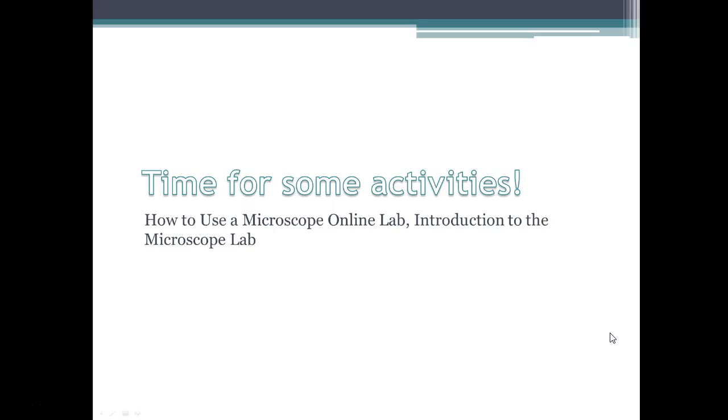So again, the best way for you to learn how to use the microscope is to actually practice in lab. And again, I would encourage you when you're in lab to make sure each person in your lab group, which is usually going to be a group of 3, gets roughly equal time on the microscope so that you know how to use it. And if you have any questions at all, make sure you ask.